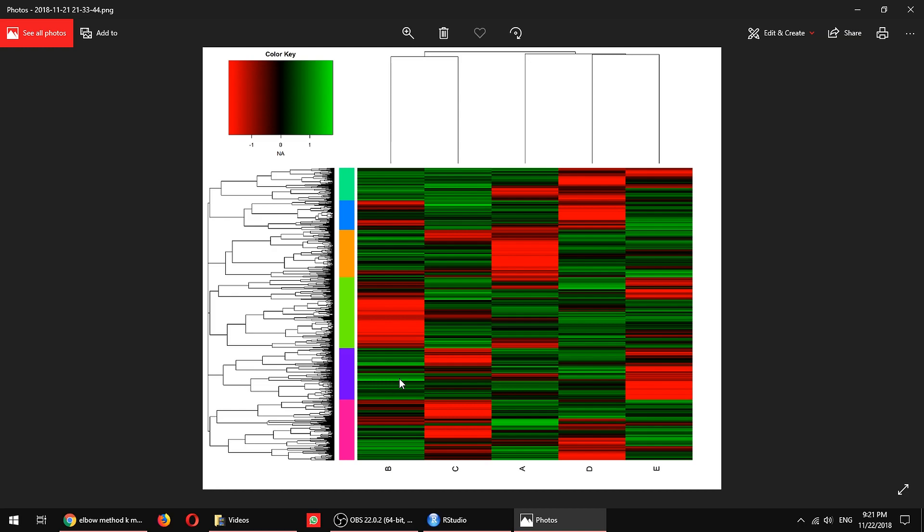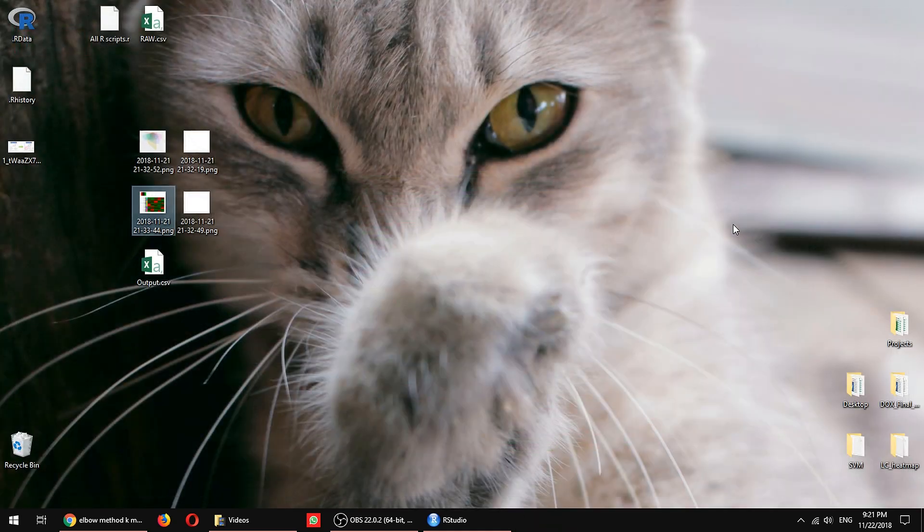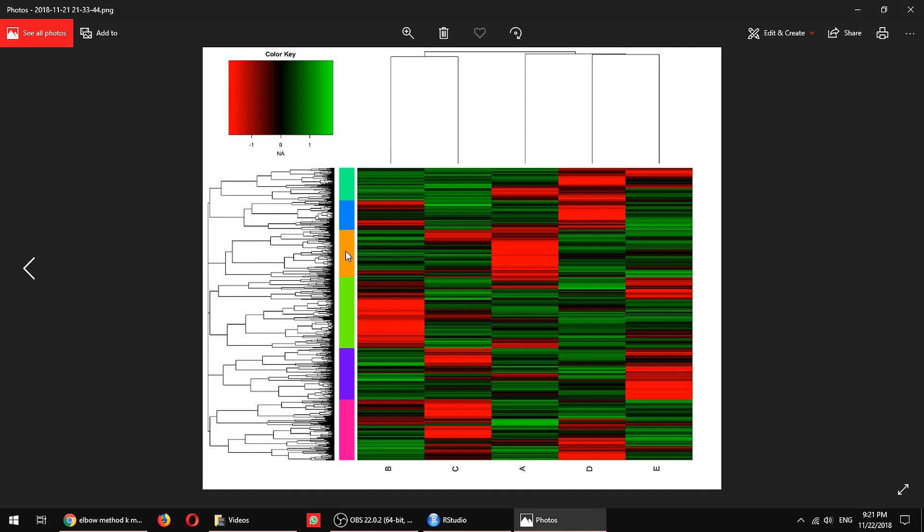If your dataset looks like this, you might need to redo your experiment or consider some other method of data analysis. But in this second video, I'm just going to show you how to actually determine how many clusters do you need. In this case, we have settled with 6.